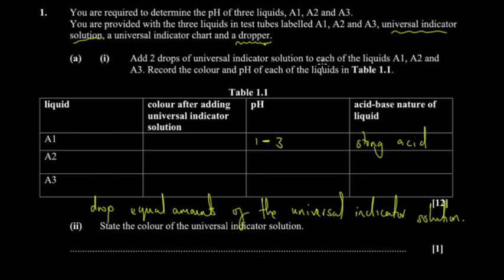Those are some of the things that you have to look out for, and then look out for contamination of test tubes, because it's an error as well. If your test tubes are contaminated, then it's a problem.